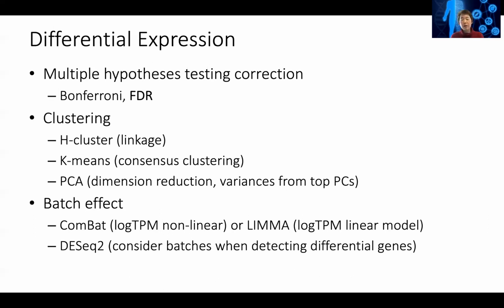Say we want all the genes that meet FDR 1% and a twofold change to get you to the more robust differential expression. Because for a lot of the later analysis, you probably want to control your total number of genes to a reasonable number, usually less than 1,000 genes, especially for gene ontology or pathway type of analysis.